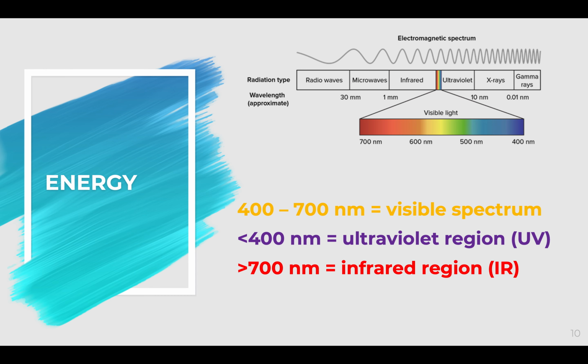Okay? We're not measuring how bright the light is, our goal is not to measure the light itself. What we want to measure is the specific wavelength of light, a specific spectrum, a specific region. Okay? So again, that is very important.